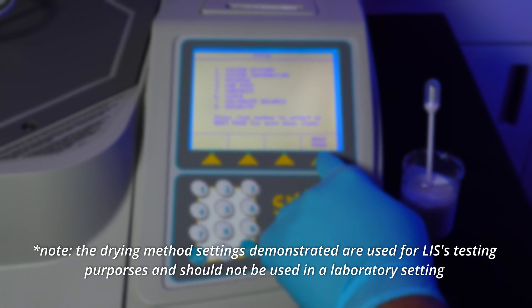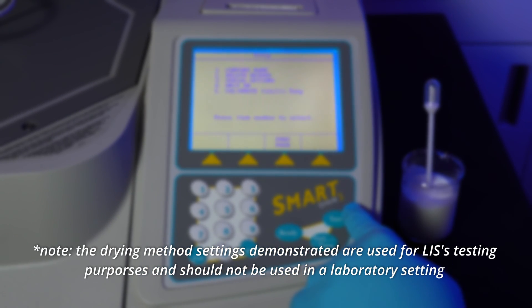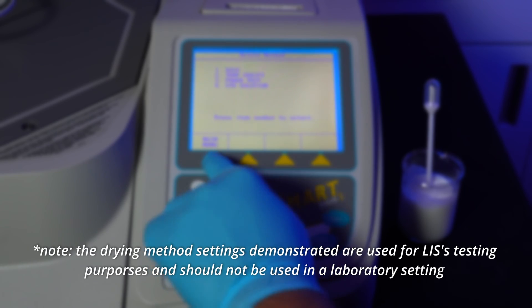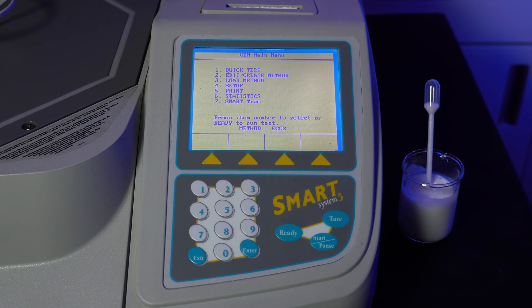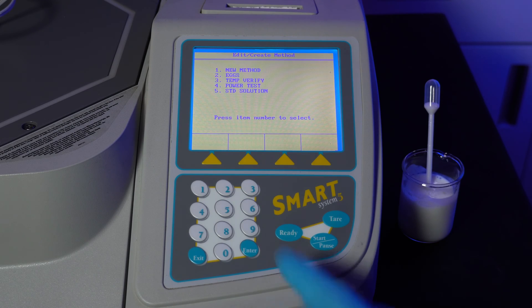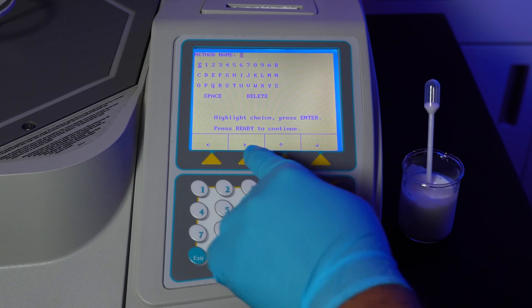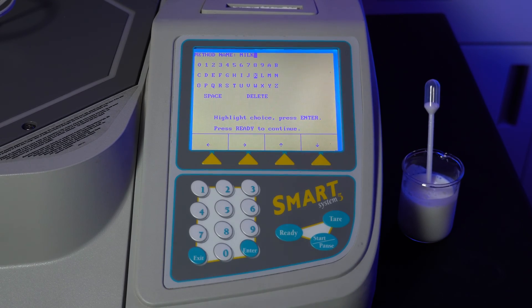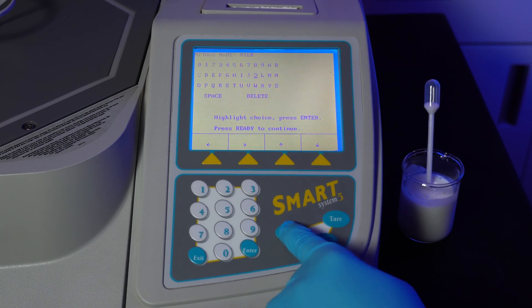Before doing our first test, we'll create a new generic drying method. This will ensure that every time we test a specific sample, our testing methodology will be constant and our results will be accurate. To create a new method, while on the main menu, press 2 to edit or create method, then press 1 for new method. Press the triangles corresponding to the arrows to type out the method name, hit enter to select the letter, and when done, press ready.